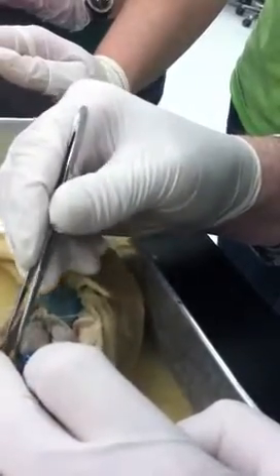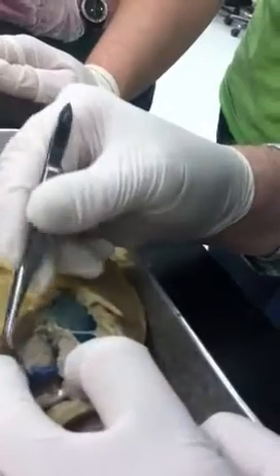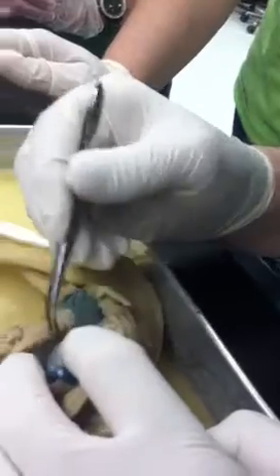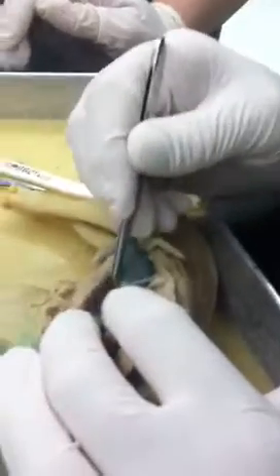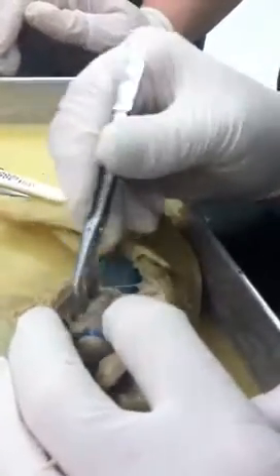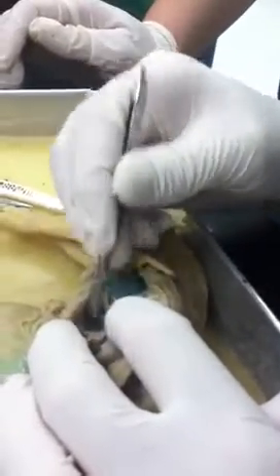Okay, you're taking off the pericardium? Yeah, it's the membrane around the heart. The reason I'm remembering iodine and the thymus for some reason. So it's just working as a protective layer to the heart then.